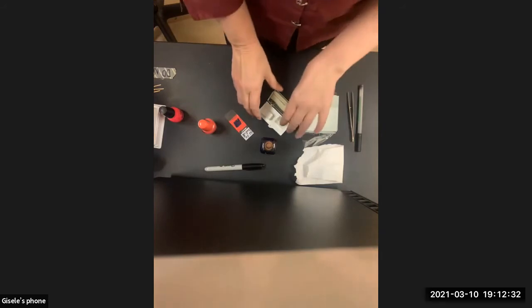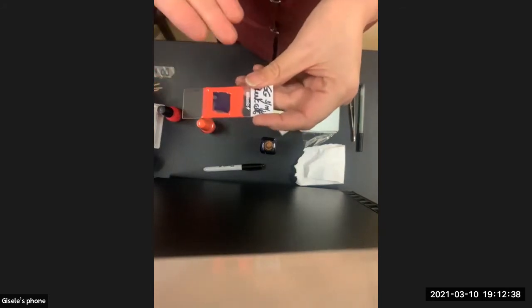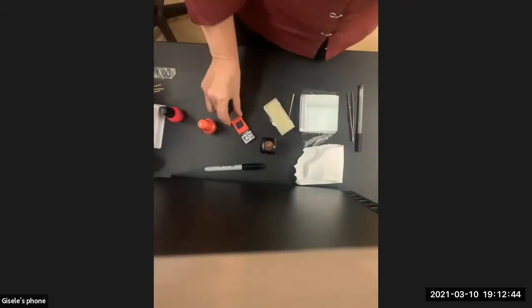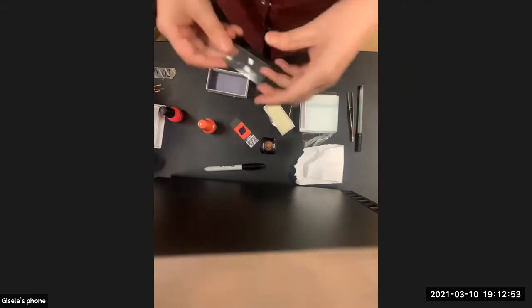You can keep the slides that you make in the empty slide box we gave you. Obviously, you're going to make cheek cells, but you can make all sorts of cool, fun slides with whatever you find out there and want to look at. Some of the things are going to be too fat, and that's where a depression slide comes in.